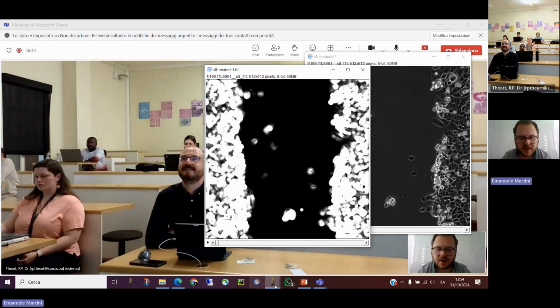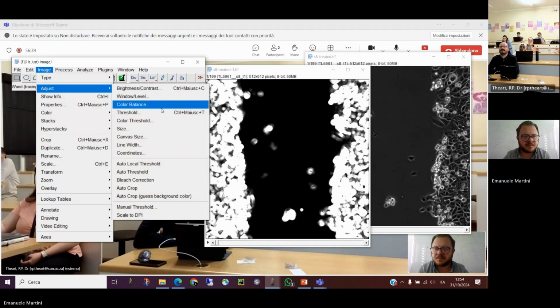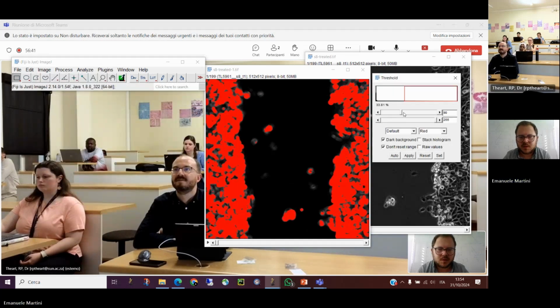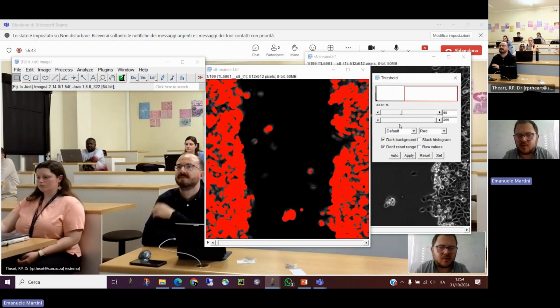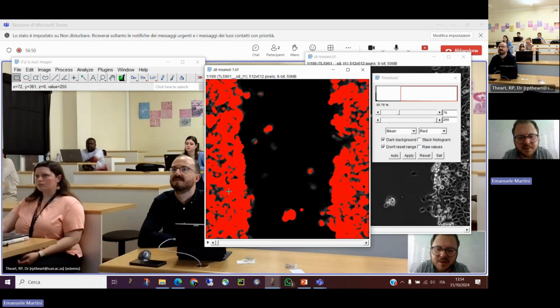Carry on. Now at this point you can really go to the thresholding. Here you have different methods to try and see which one is good. Please put yourself on the first frame.